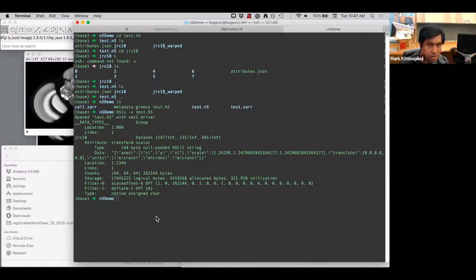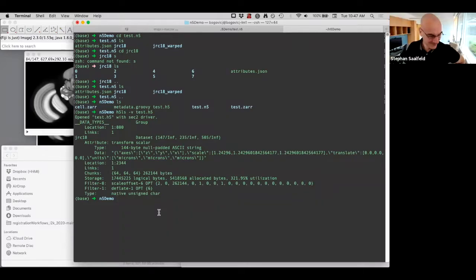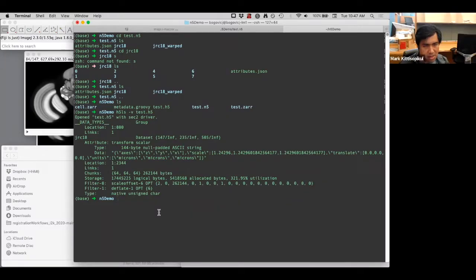Yeah, one challenge to me looks like the attribute tree has a hierarchy in it, and I'm not sure how well that maps directly into some of the HDF5 attribute structures. I think there is maybe group data, but I'm not sure if HDF5 attributes are designed to be hierarchical like this. I might be wrong.